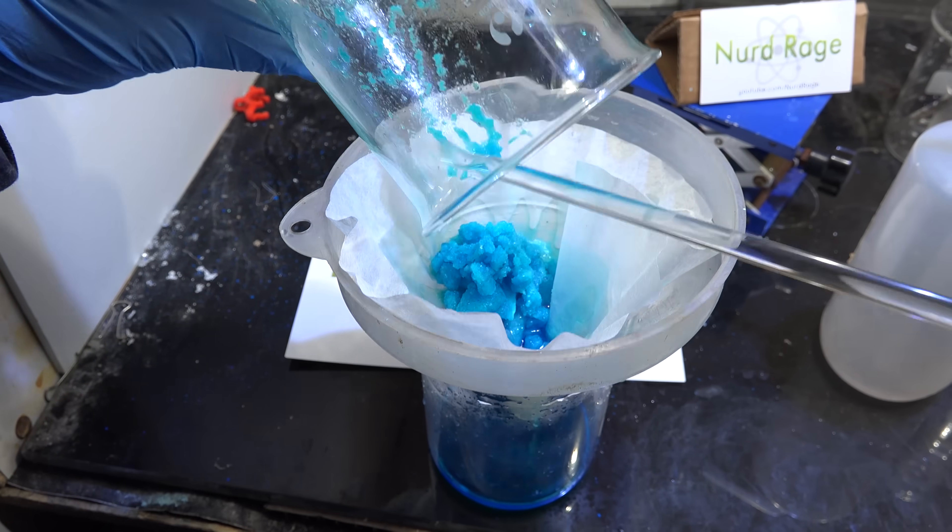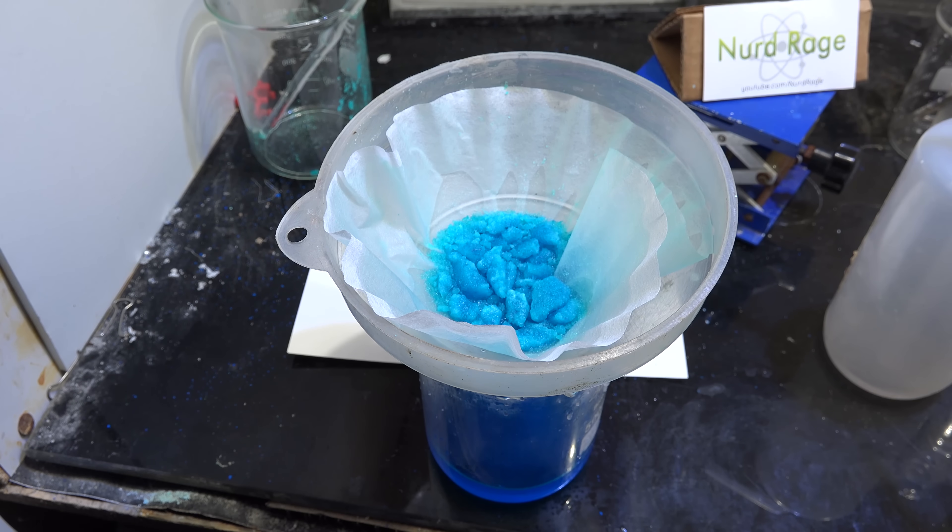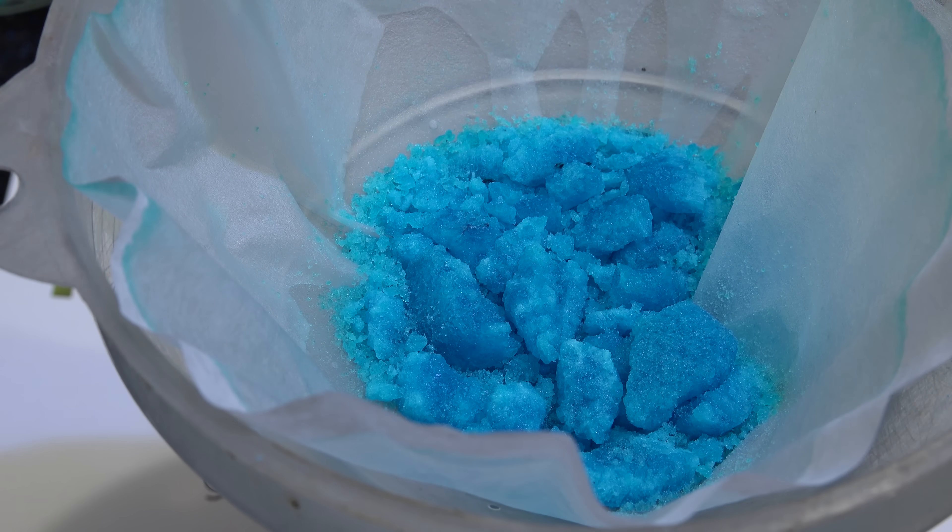Now we filter out the crystals, give them a wash of ethanol, then let them dry on the filter paper. And there it is — copper formate tetrahydrate.